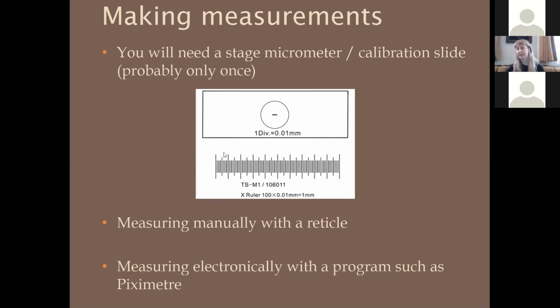But at different magnifications, things are going to be different sizes. So when I'm looking at 400 times magnification, it's not a 1-to-1 ratio with what I'm seeing in the little eyepiece. At 400 times magnification, I need to multiply my measurements by 2.5 to get the actual real life measurement, right? Because the 1-to-1 is at 1,000 times, and 400 times 2.5 equals 1,000. Does that make sense?